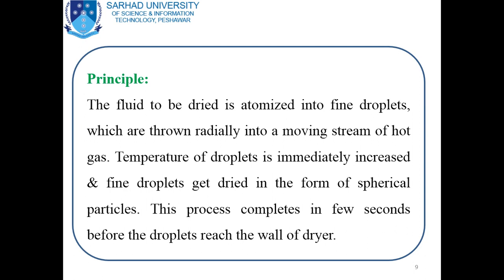You want to dry the fluid, that is either a suspension or any other liquid. First of all, it is atomized into fine droplets which are thrown radially, forming a radial shape, into a moving stream of hot gas. By the application of hot gas, the temperature of the droplets is immediately increased, and the fine droplets get dried in the form of spherical particles after exposure to the hot gas, as I told you in the first line.